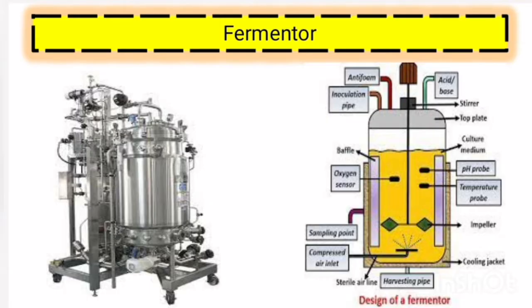What is a fermenter? Fermenters are bioreactors that offer the best growth for the microorganism. And also, it aids in the fermentation process.